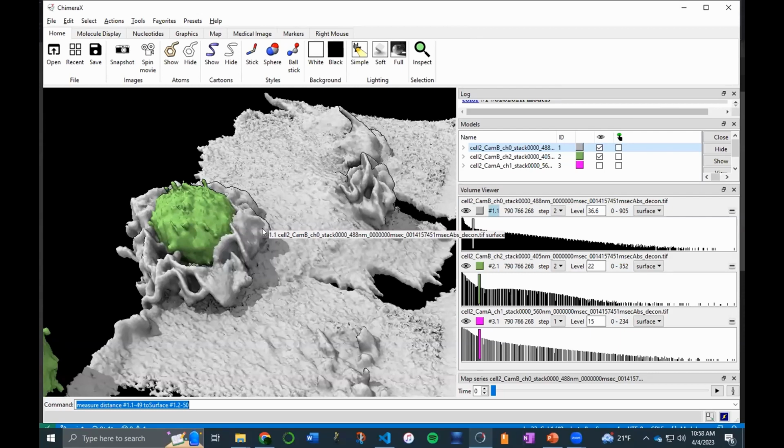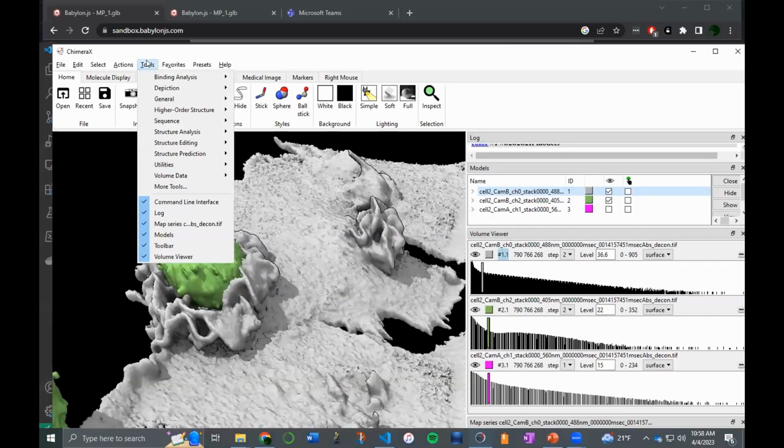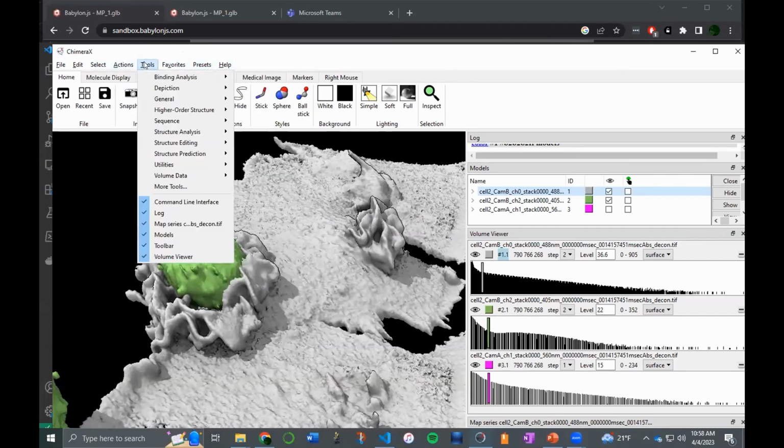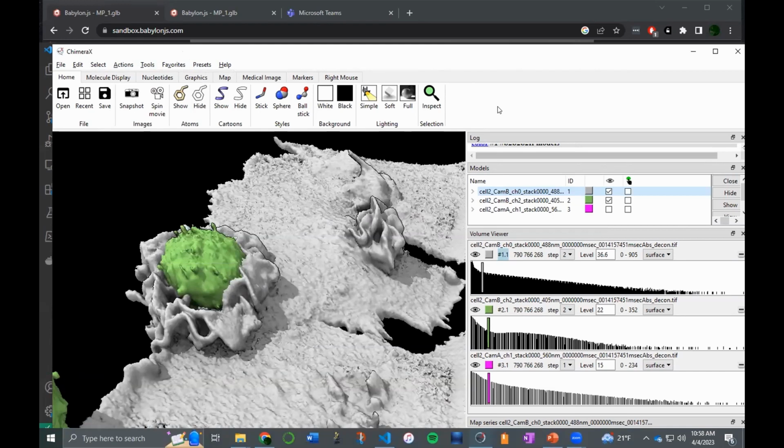That's cool. So I guess when you download Chimera, you'd have to also download the code that you wrote. So there's the tool shed in Chimera, and so there are others. So in here, let me see where it's at. In tools, I forget exactly where it's at, but there's a tool shed, maybe under more tools. I don't remember, I'd have to look. Basically, it's like plugins that you would have for ImageJ.